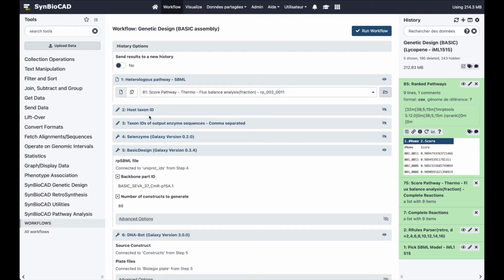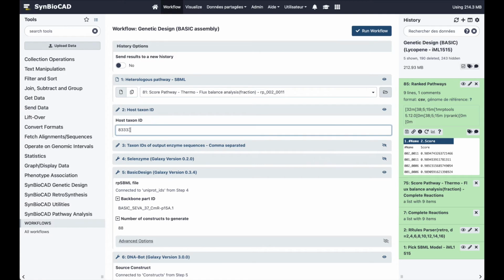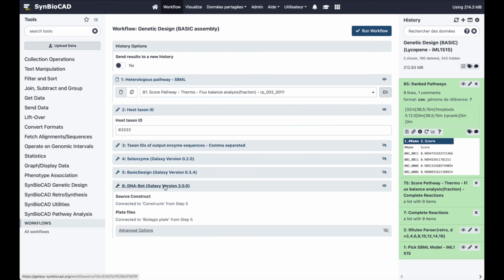The second parameter is the taxonomy ID of the host where one wishes to produce the target. 83333 is the strain K12 of E. coli. One can also filter the enzymes found to catalyze the reactions of the pathway by indicating one or several particular organisms. We can now set all parameters of each step by clicking on different nodes of the workflow to modify them.